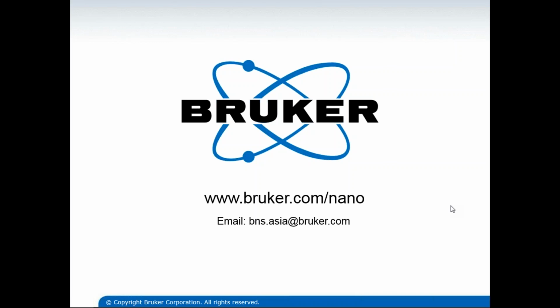So we have a question asking whether, if the Vision64 Map is given, will the Vision64 be given as well? So the answer is yes. The main Vision64 software is applicable for data acquisition, as well as some of the standard analysis that is listed. You can do that with the Vision64 main software.